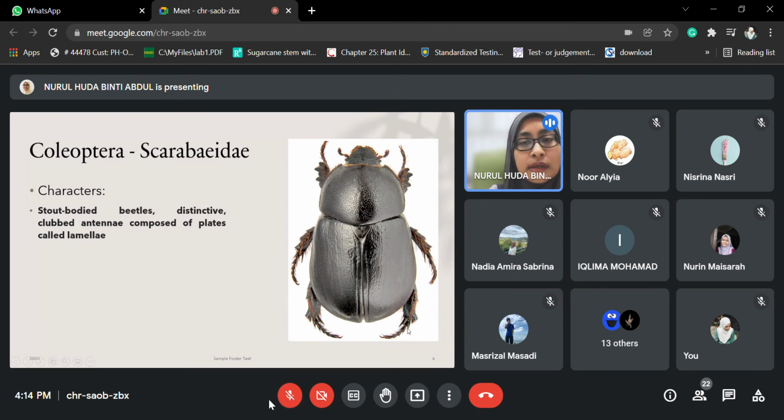There are also juga some part of, if you see at the leg here, other than bristle or hair you kata tadi ni, okay, there are also part yang kamu nampak yang a bit thicker ni lagi. Okay, ni actually is not hair. We can call it as a spine. Okay, macam berduri. Here, as you can see, dia punya tibia. Okay, this part is actually tibia.